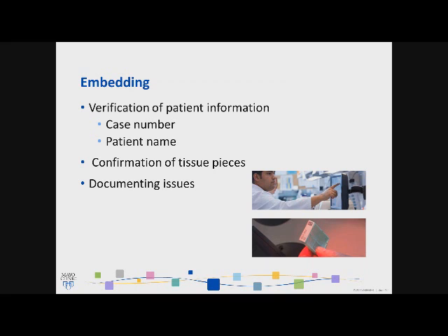If you track, either by hand or with scanning, or just in spreadsheets, which processor they go into, you can then determine if there are any quality issues on the backside, what might be the root cause of that issue. Right now we have chosen not to continue that process because we have gone entirely to formalin fixation processing for all our large specimens.